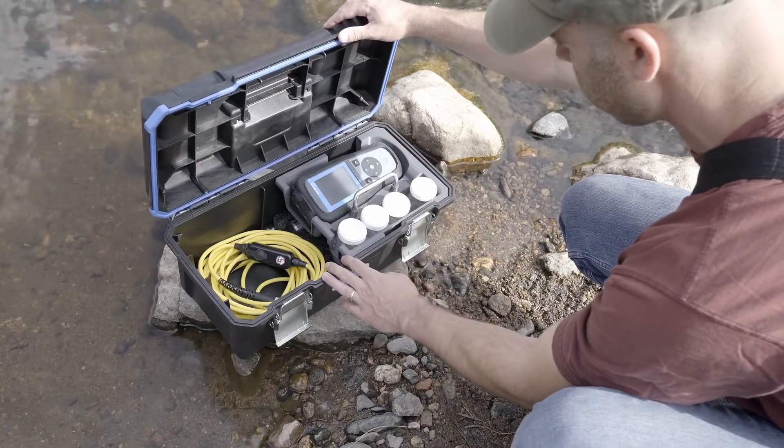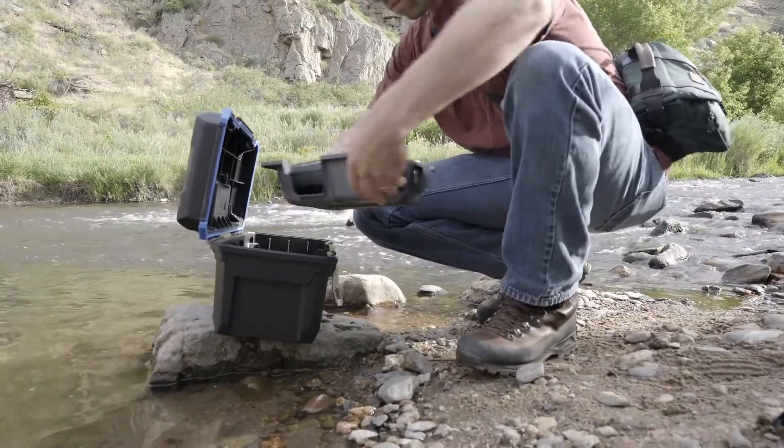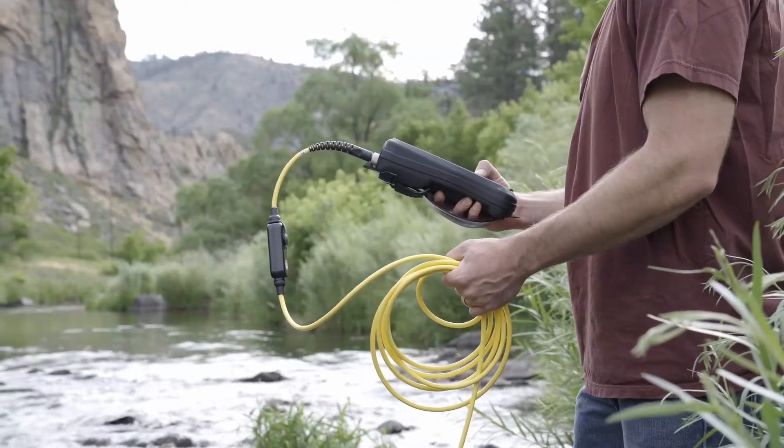The HQ series takes durability to a new level, offering an IP67 protection rating, including the battery compartment, not to mention passing the 810 military standard.